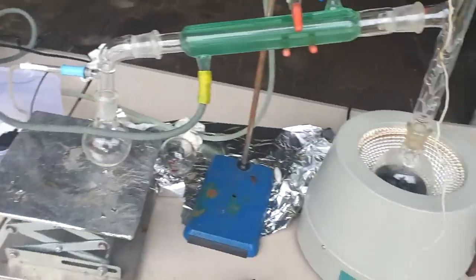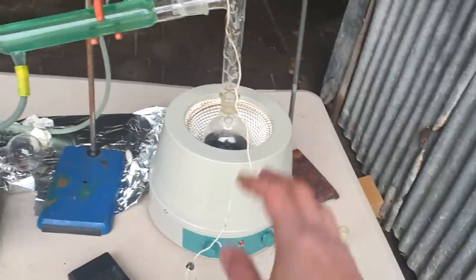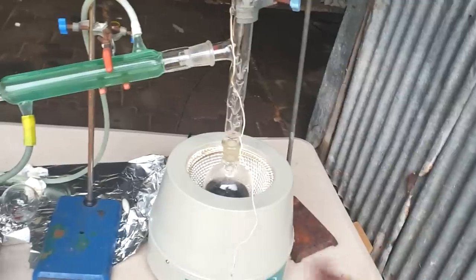When our first fraction comes over, I don't know what temperature this is gonna be because I don't really know what pressure it is in this system exactly. But you know, the first fraction is just gonna be solvent, so we're just gonna be waiting for that first fraction to come over, then the temperature should rise somewhat, and then we'll have to take off the vacuum, change over the flask, put it back under vacuum, and then continue heating it for that second fraction, which should be our product.